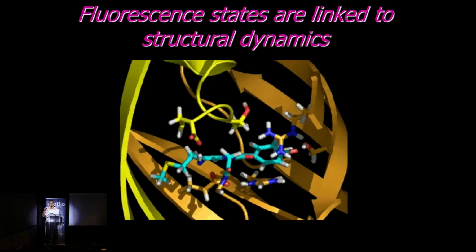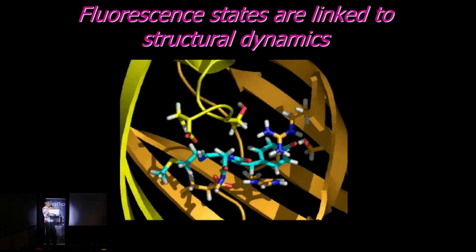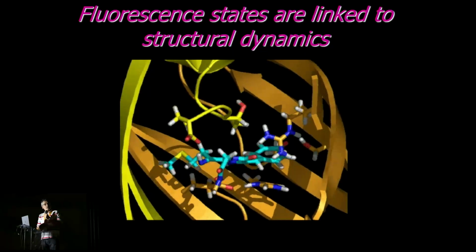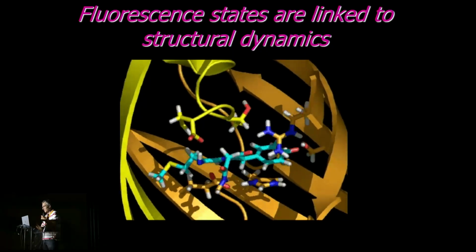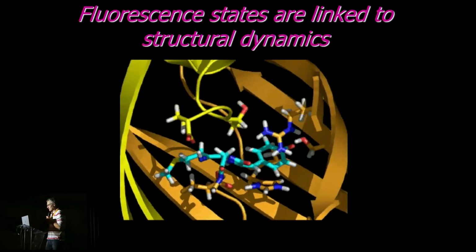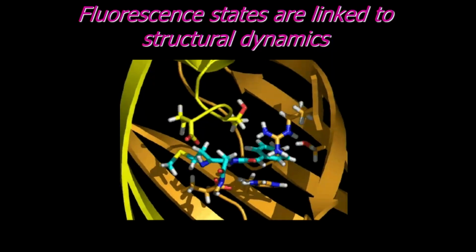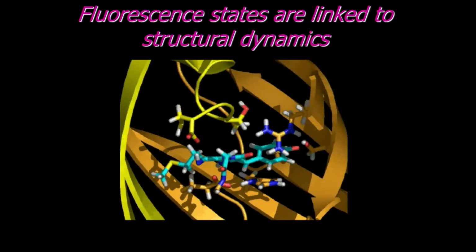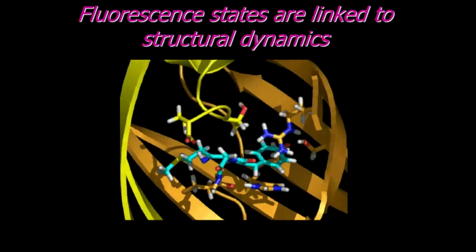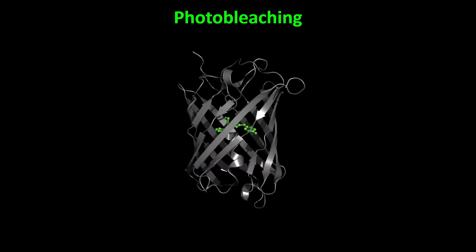Although FPs are usually presented as a kind of rigid structure, there is actually motion in there, and it's behind the highly complex photophysics that many fluorescent proteins exhibit. So I will quickly go through the different kinds of phototransformation that fluorescent proteins may show, but this is also valid for many fluorescent dyes. So it's a kind of recapitulation.